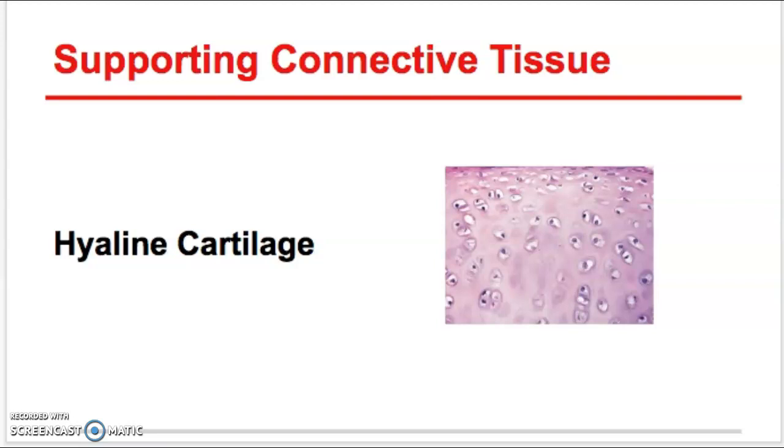And that covers our connective tissue. So I hope this video is helpful with your field guide to tissues. Your lab manual, if you have it, and your textbook also have all of this material and will help guide you along your journey into tissue understanding.